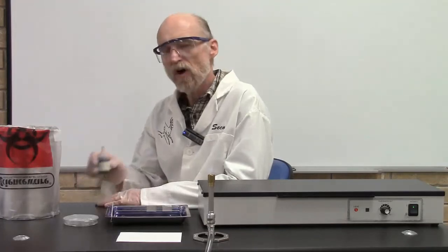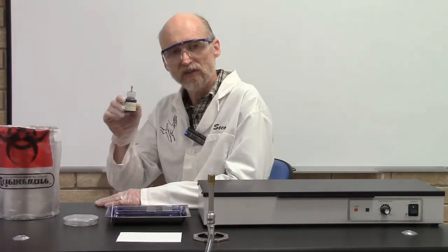The reason we call it the negative stain technique is because we're applying a stain that carries a negative charge. You'll recall that bacterial cells have a negative charge too. So the cells actually repel the stain, and we're really staining the background. What you get is a white cell against a dark background. You get really nice contrast.